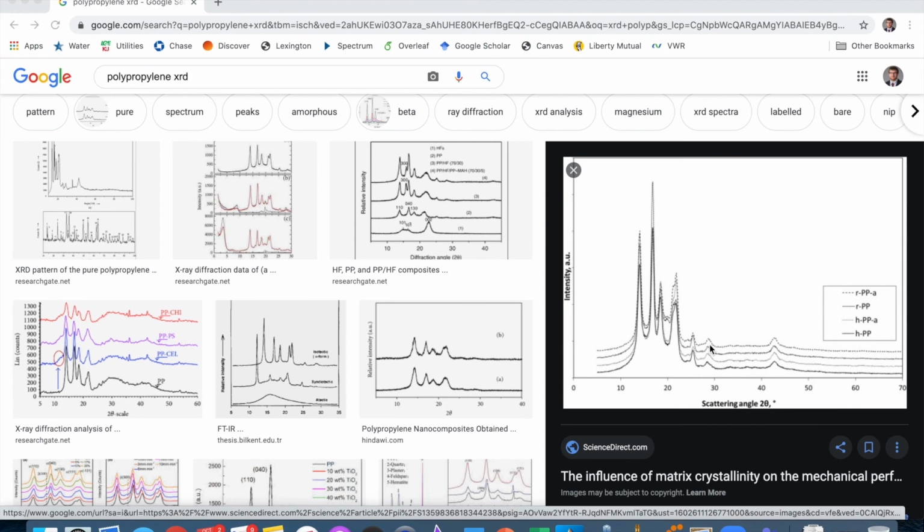So again, this is where you'll probably want to wait until the last step, where you've got a very short list of polymers, potentially only 2 or 3, that you then find reputable XRD patterns for and compare to your own sample. You'll find that at that point it's much easier to get a match when you only have to look at a few different possibilities. We've done this in previous semesters, and we can typically find reasonable references for all of our samples and get good values, as long as you've got a list of candidates using the other properties that you have. So you've got to get that short list first.